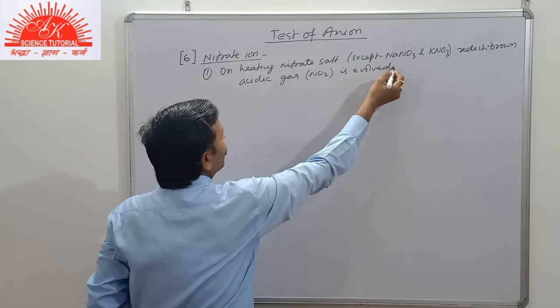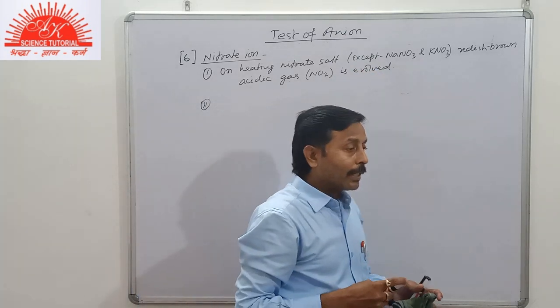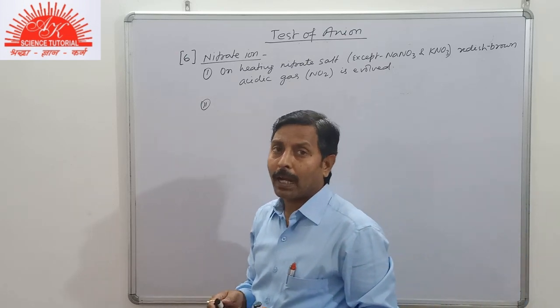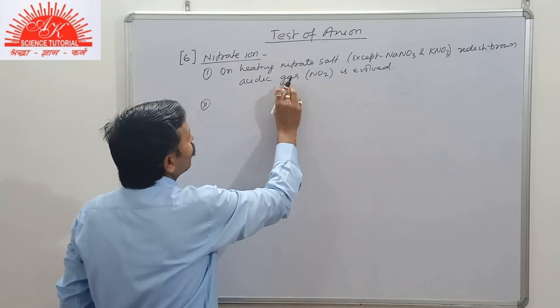This is the basic heating test, but it is not taken for the practical. Actually a chemical test is required here.